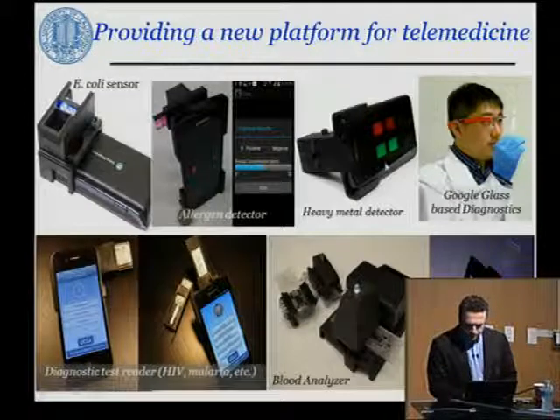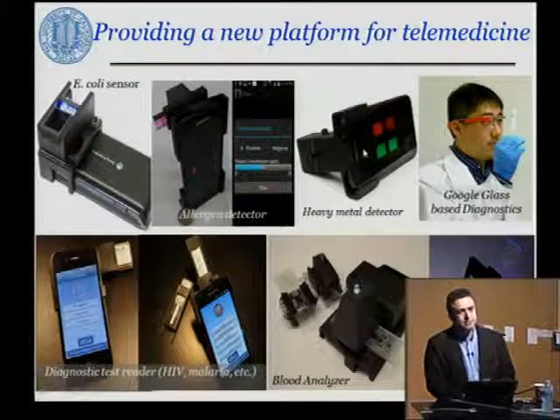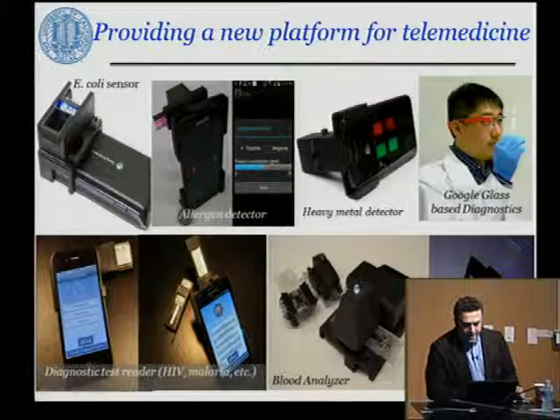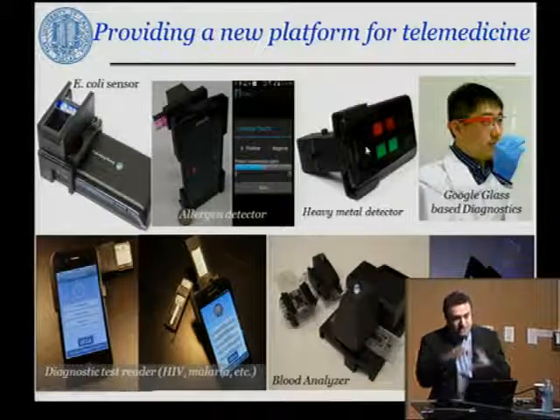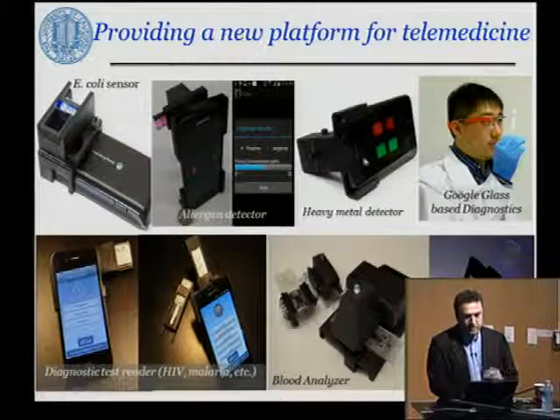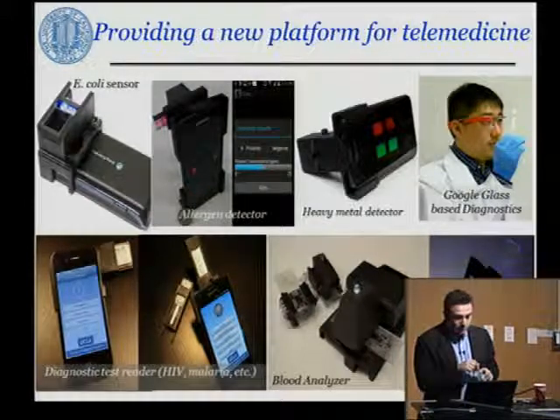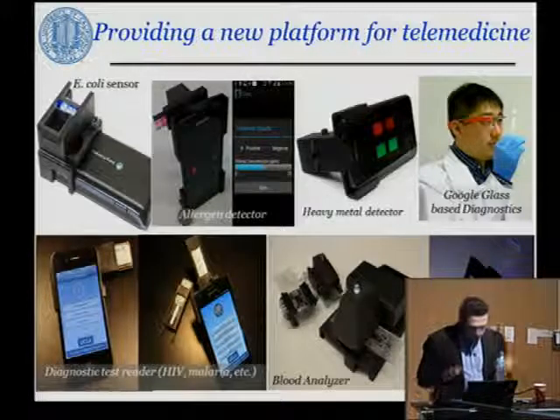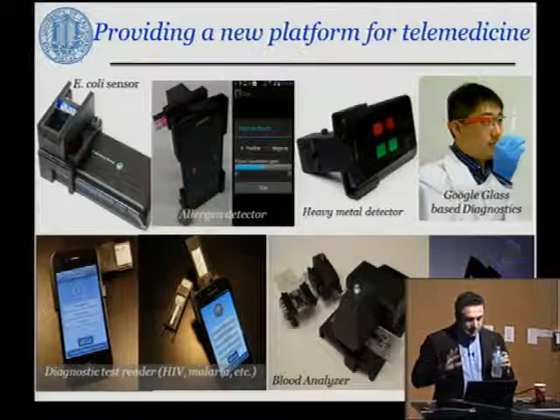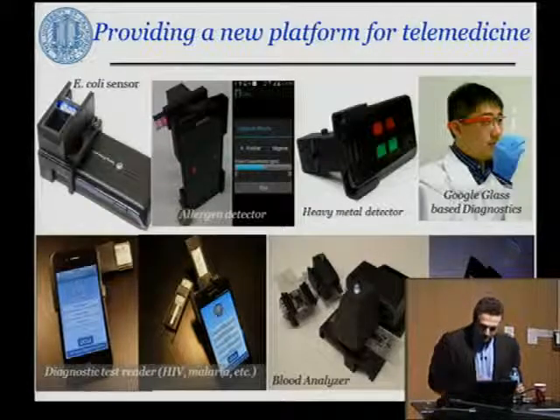In this example that I'd like to briefly mention, this is actually a nanoparticle-based assay, which is looking at, in this specific example, mercury 2 ions, mercury contamination in drinking water, and based on clustering of nanoparticles and the color change that is quantified using an Android application, you can detect the presence of mercury with about 3 to 4 parts per billion, nanograms per mL, level of sensitivity. So these are some examples where mobile phones or mobile phone parts have been instrumental for pushing the limits of some of these measurement tools to field-portable designs integrated with mobile phones.